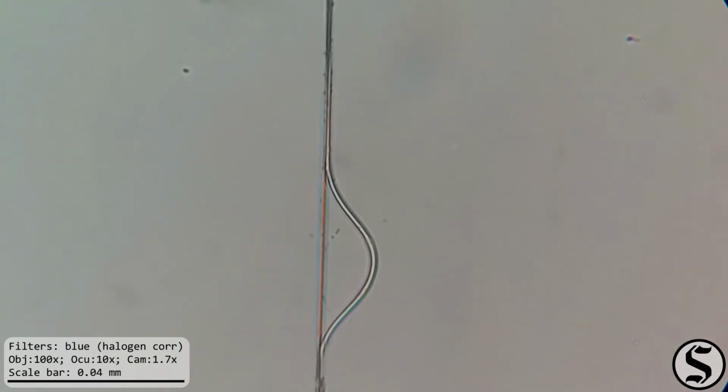At really high magnification, we can really see those two threads. From what I could tell researching, this is a common feature of spider drag lines. Those are the silk threads that they make not to be sticky, but to be strong. Well, I think it's really interesting that it's got these little bunched up sections in it.